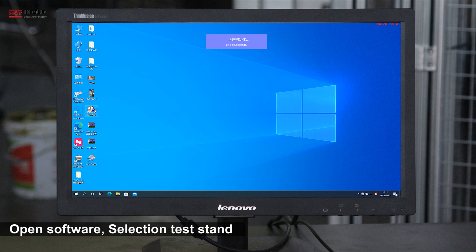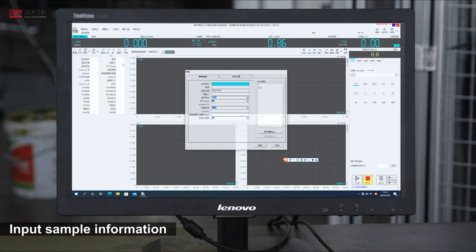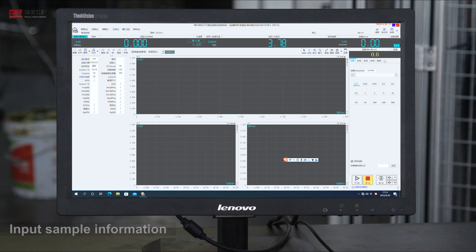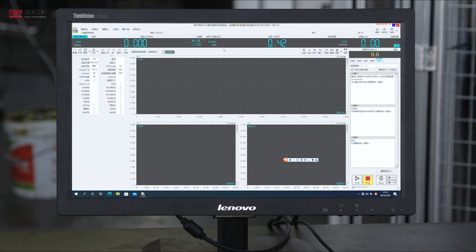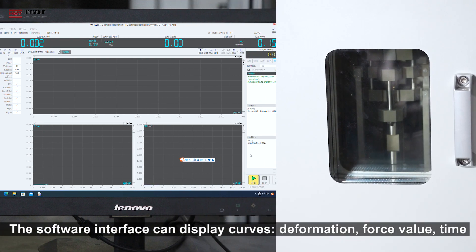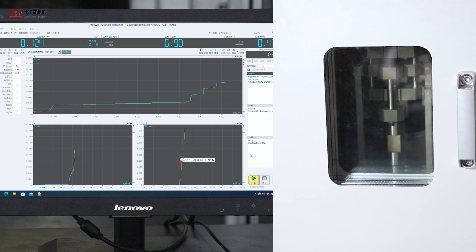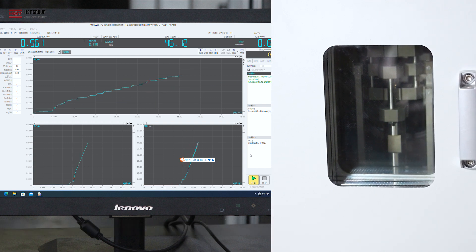Open the software and select the test stand. Input the sample information. The software interface can display curves, deformation, force value, and time. Open the software test pattern.